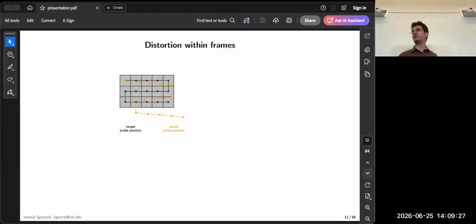And here, maybe I oversimplify things by illustrating that by assuming that we have a constant error throughout the experiment. In reality, what is causing this error is not as consistent, not as controlled as what I'm showing here. There are environmental factors and very many uncontrolled factors that can affect the position of the probe. So if you want to have a conceptual image in mind, you should be thinking of something closer to what I'm showing here, where the error is following some sort of deterministic pattern on which is superimposed some sort of random perturbations, random fluctuations. So what is happening? We aim for the black trajectory.